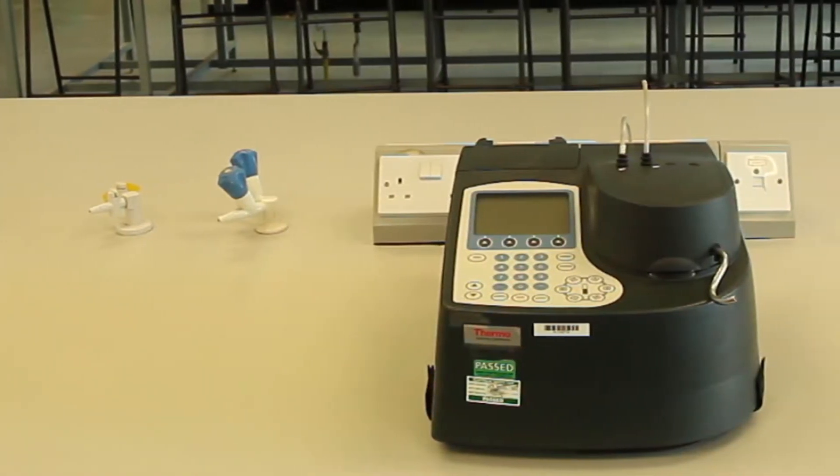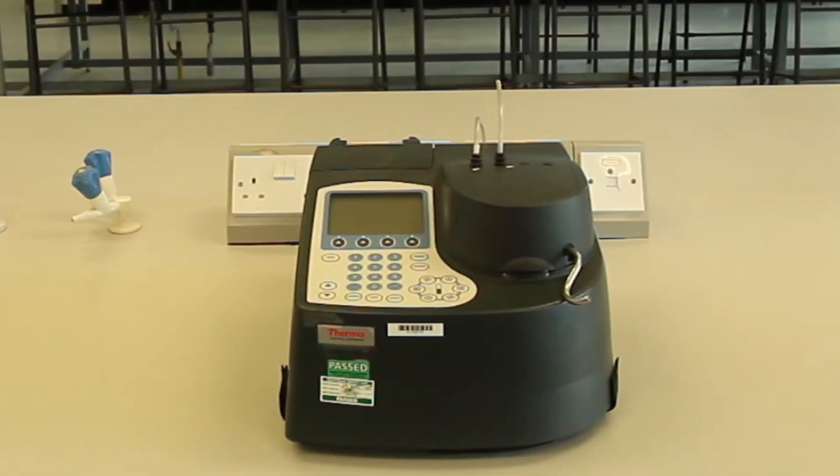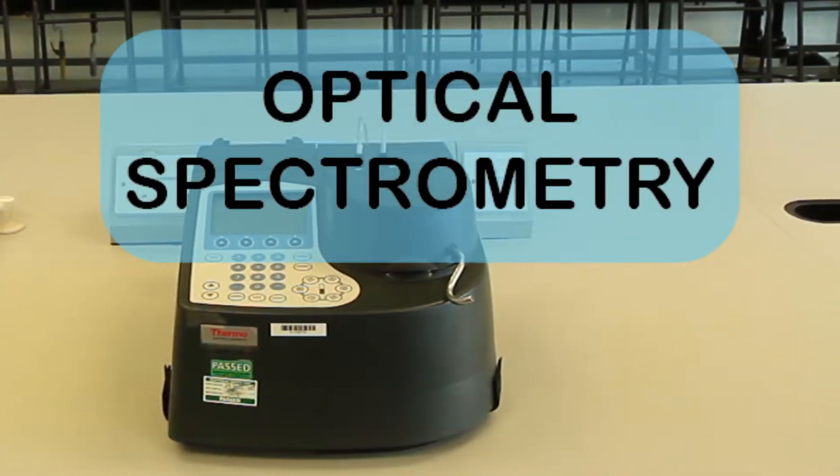Today we are really just going to get to grips with what we think will be the most commonly encountered spectroscopy that you'll find in the lab, and that is optical spectroscopy based on visible light.